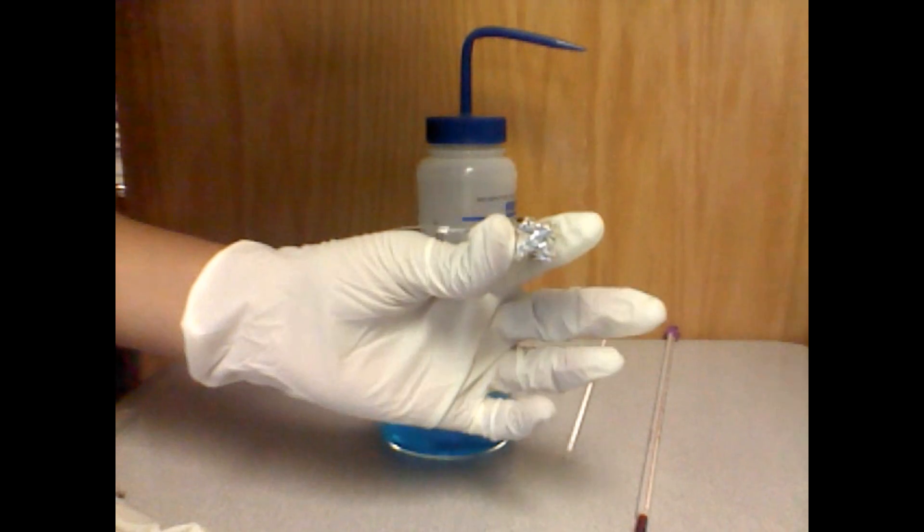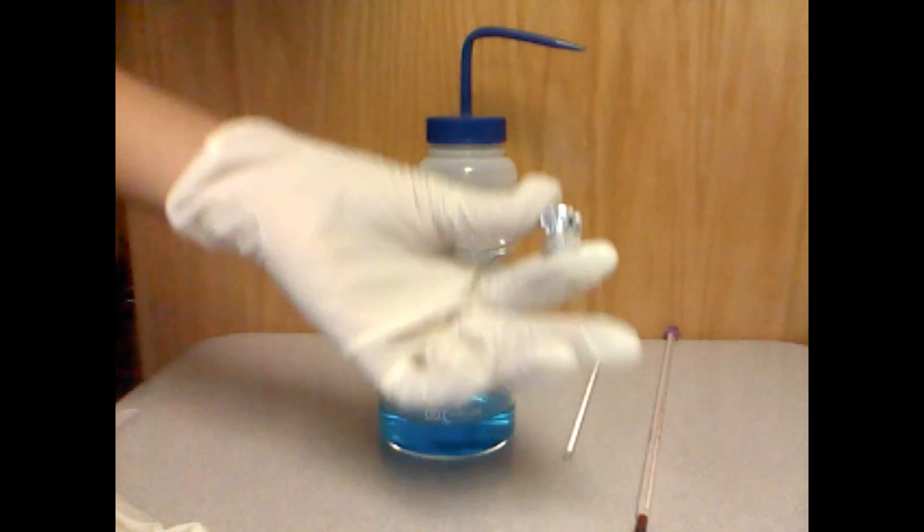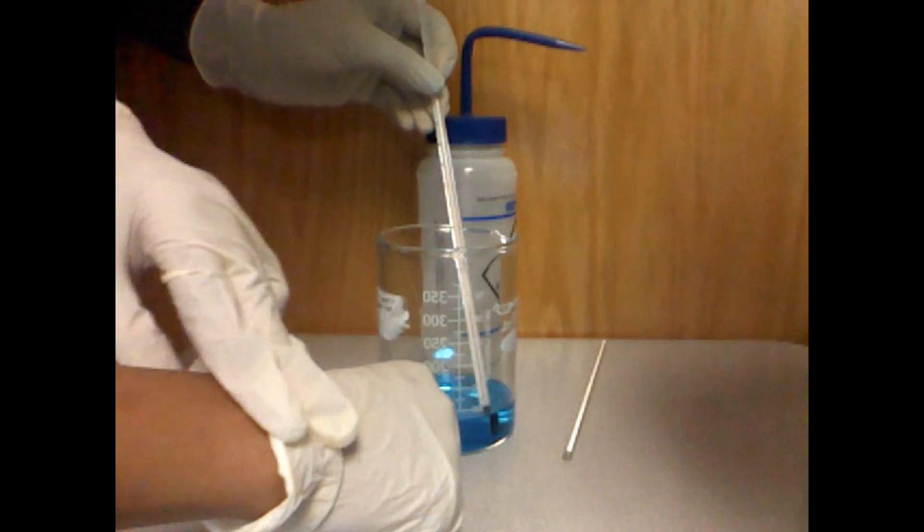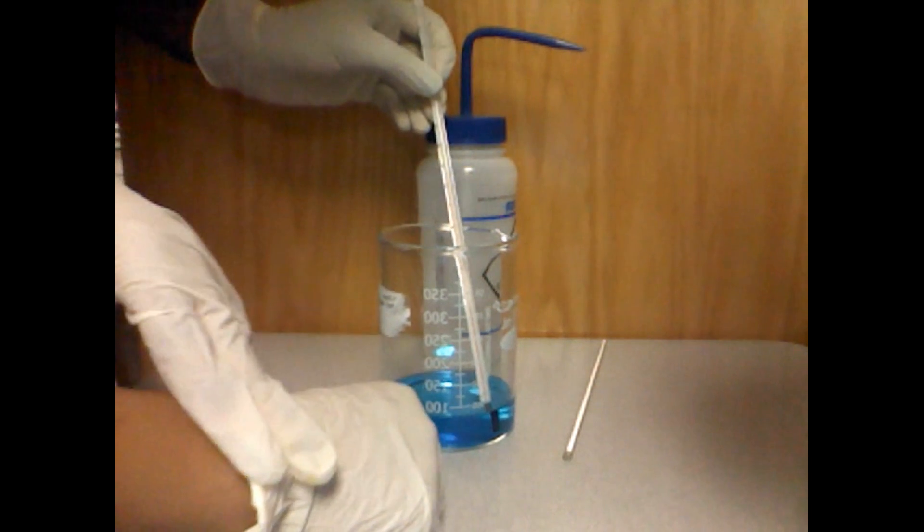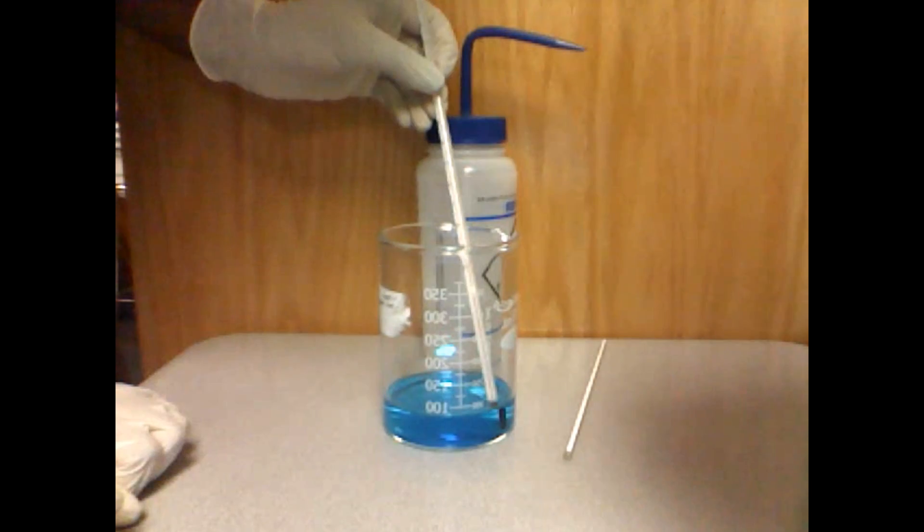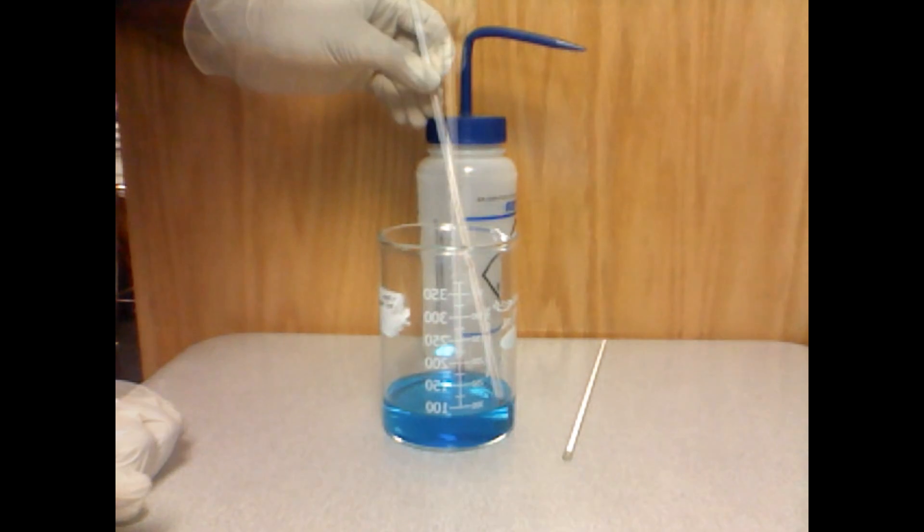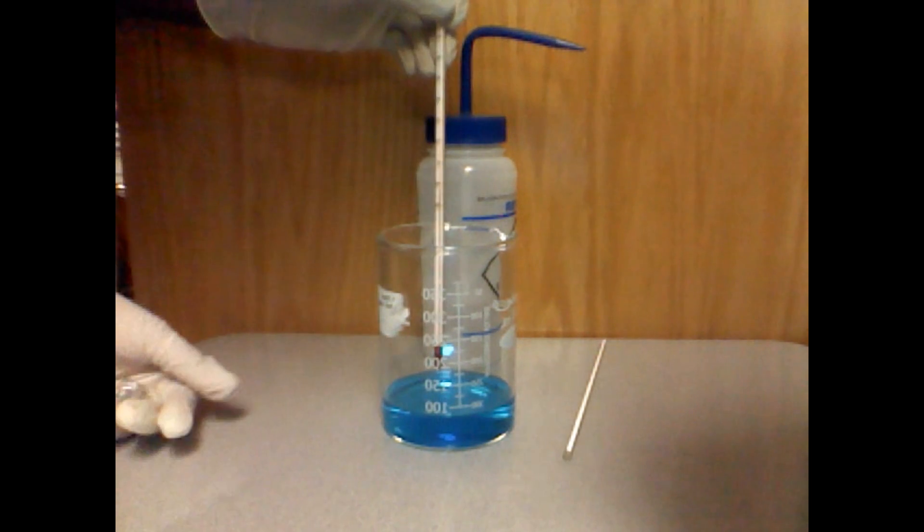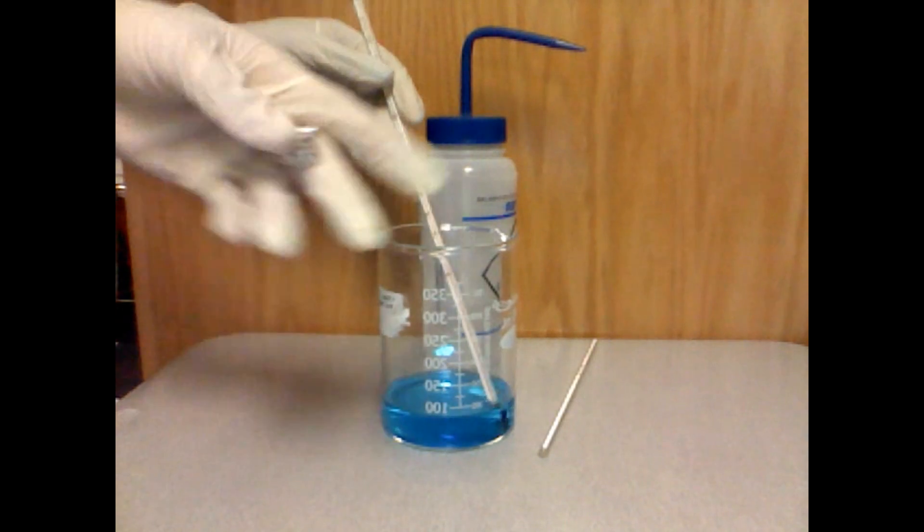We must now measure the temperature of the solution before we add the aluminum foil to it. The temperature is approximately 27 degrees Celsius.